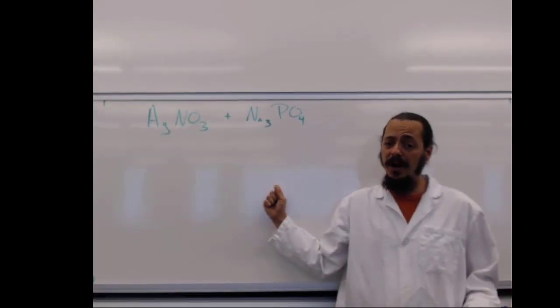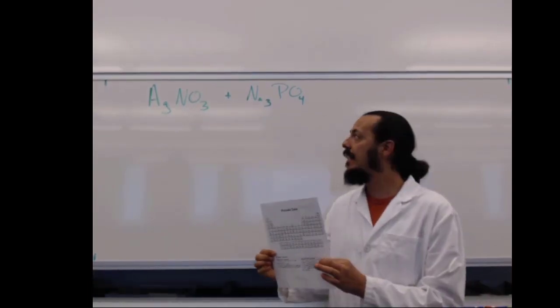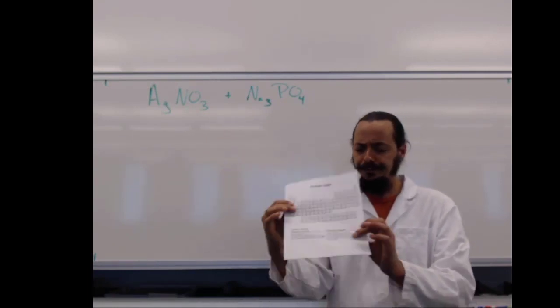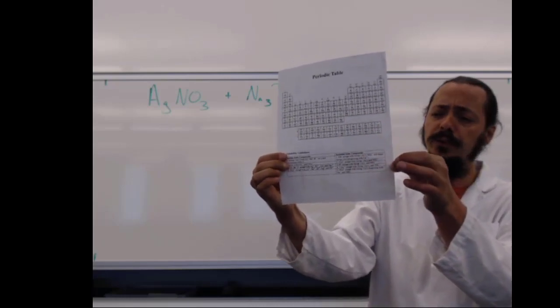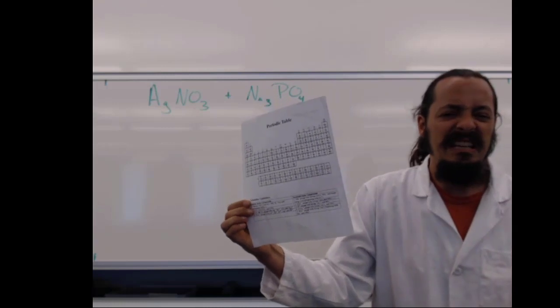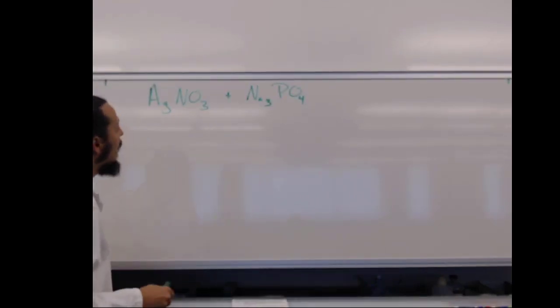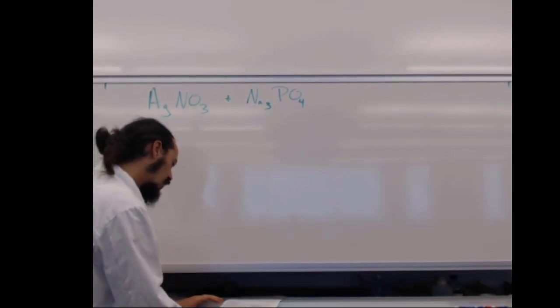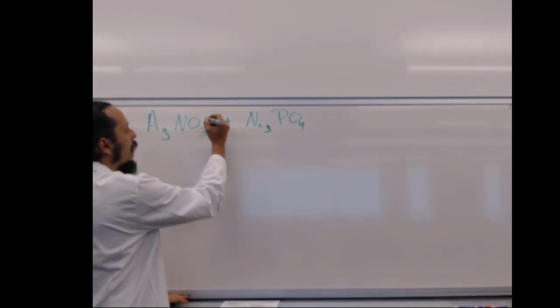After we have our two compounds, we're going to want to have our periodic table handy for predicting whether these are going to be aqueous or solids when we put them in water. You should be familiar, at the bottom of the periodic table, you've got your solubility rules. These, let's say solubility guidelines, will help us predict whether each of these compounds is going to be aqueous or solid. Now, nitrate compounds, in our solubility guidelines, rule number 2 says nitrate compounds are always soluble.